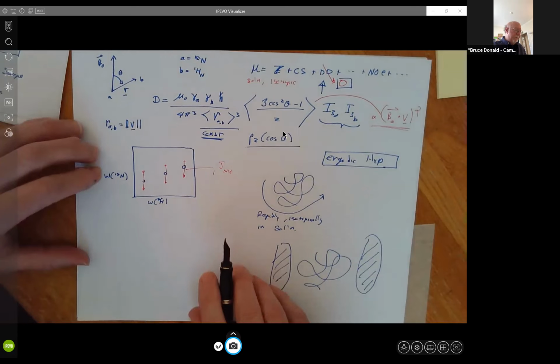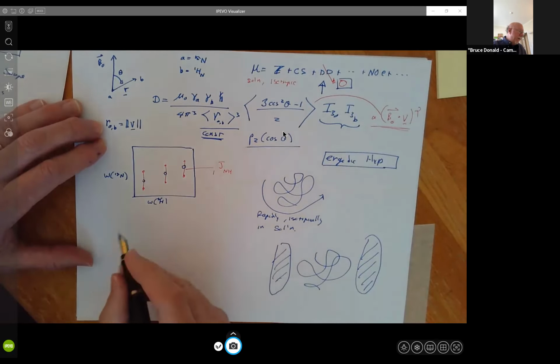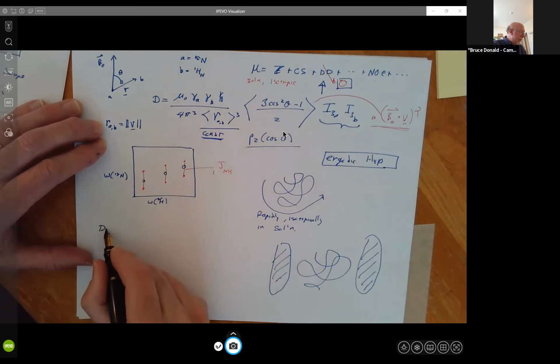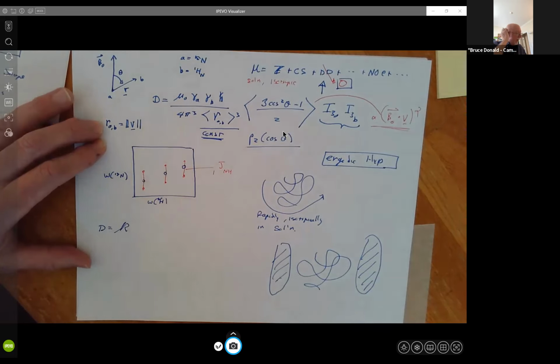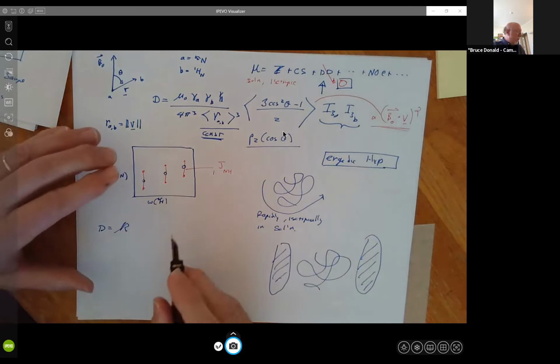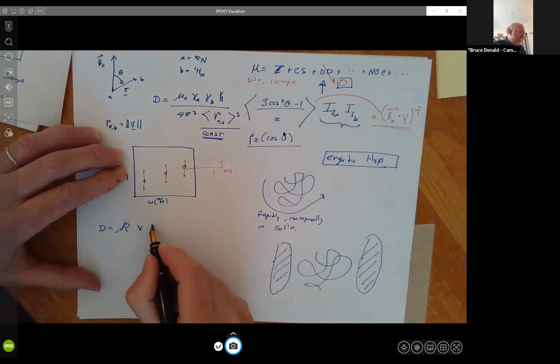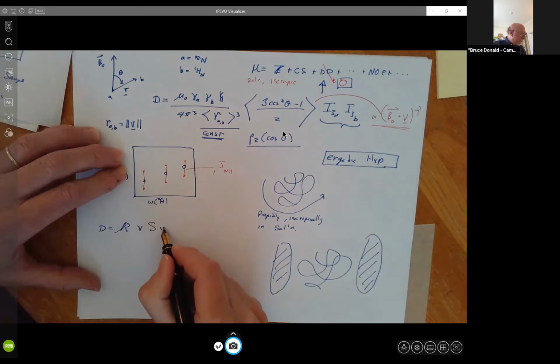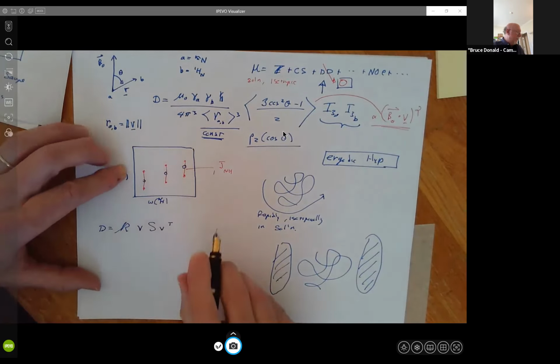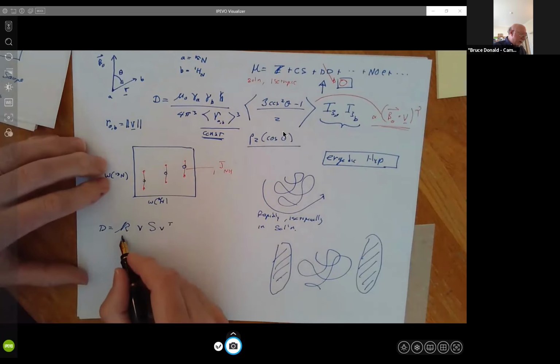So let's try to come up with some intuition for it. One thing we could do is collect all the constants, and write this just as K, a constant, times this averaging here. And one way to write this that's very popular is called the so-called alignment tensor. You can actually rewrite this as V S V transpose, like this. All right. So this is pretty interesting. What is this thing? So this is our constant.